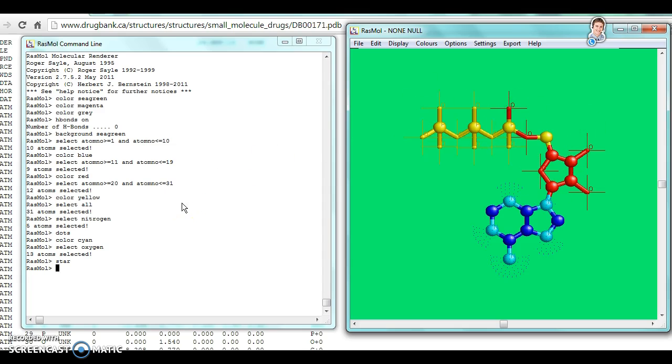So I didn't want to change any of the colors to confuse the different parts of the molecule. And last, I'm going to select phosphorus, and I'm going to color this yellow tint because there's only 3 and they line up right in the phosphate chain.